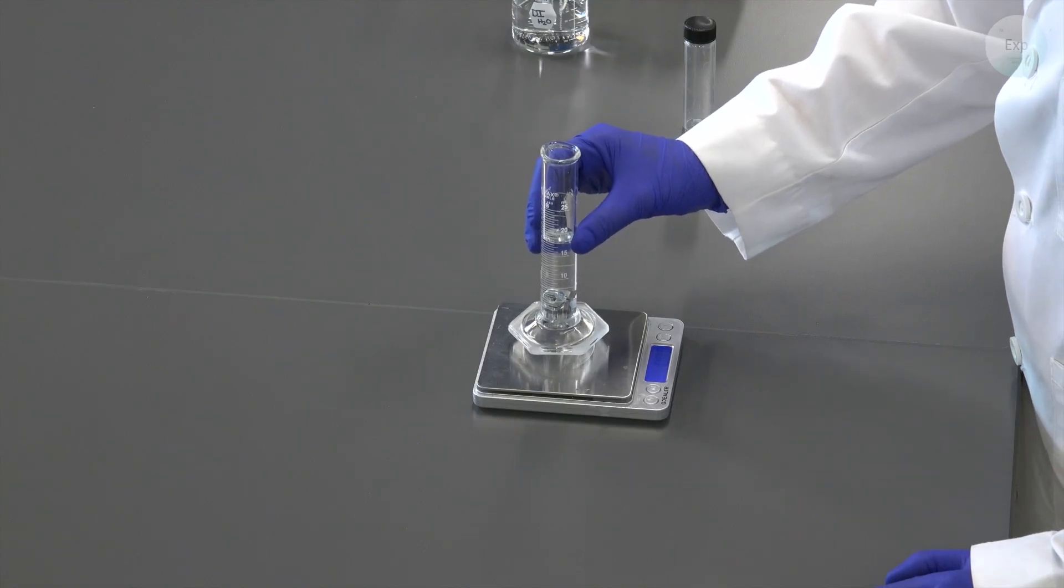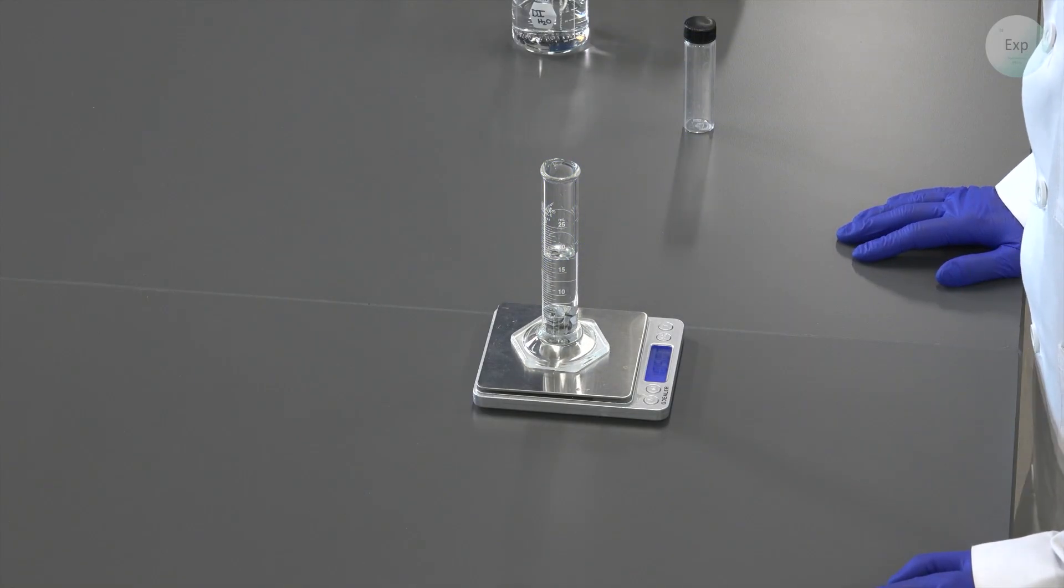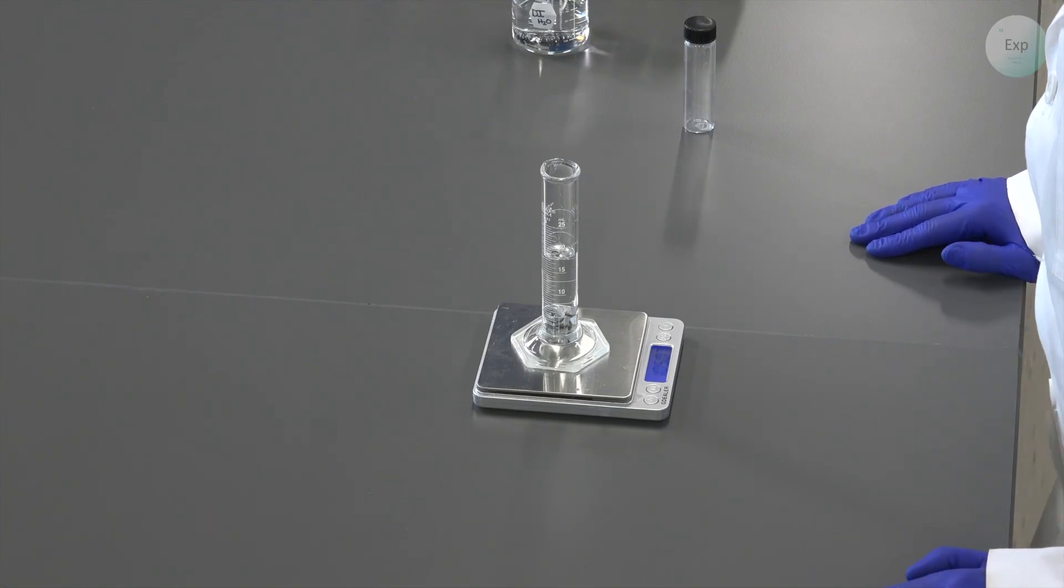Now we need to do the same with the mass. We take our object submerged in water and our graduated cylinder and place it on the scale and we record our new mass. In this case it is 105.07 grams.